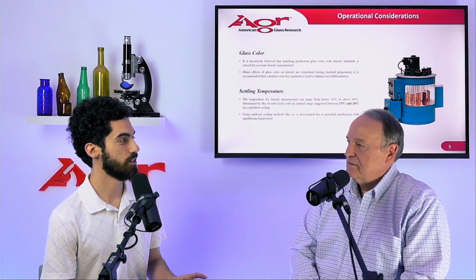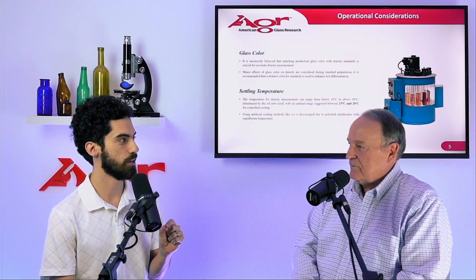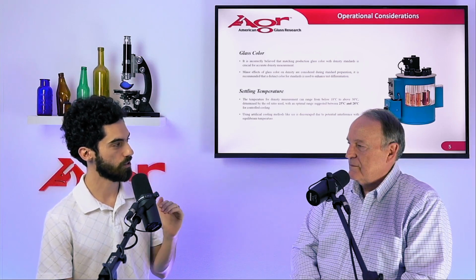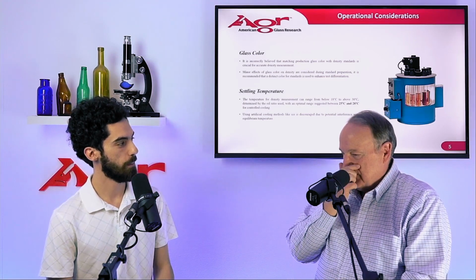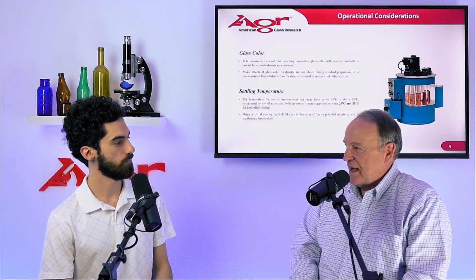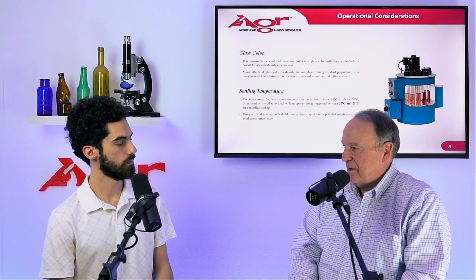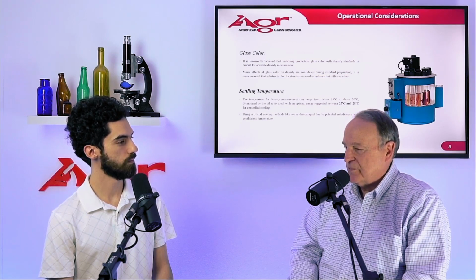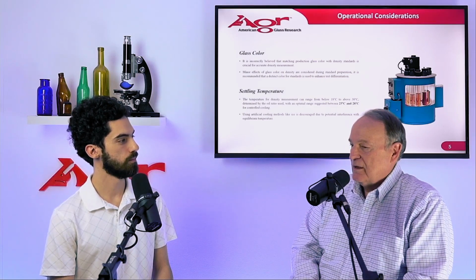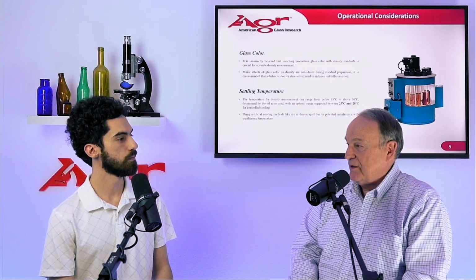Let's talk a little bit about the settling temperature. The settling temperature is a specific point, right, the temperature when you cross that reference line? Yes, that's what's called the settling temperature. The operation of the comparator is accurate between about 18 degrees centigrade and into the 30 degrees centigrade range. It's a fairly wide range of temperatures where the coefficient of density change remains constant. And so you can operate the density comparator anywhere of convenience throughout that range.